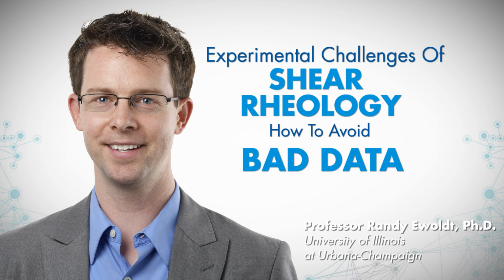Okay, good. And then you suggested that people might brainstorm other experimental errors or sources of error. One that is suggested is the human-related errors, such as what you might see in a gauge R&R. Can you comment on that? How should we consider it? What would you expect, or any sense for what the root causes of the operator error would be?